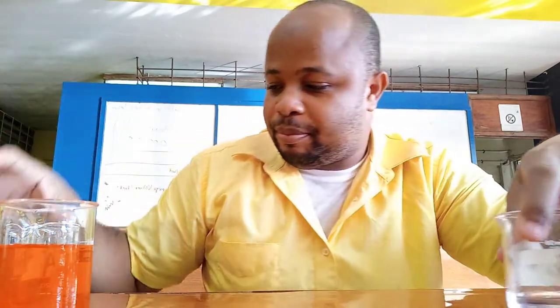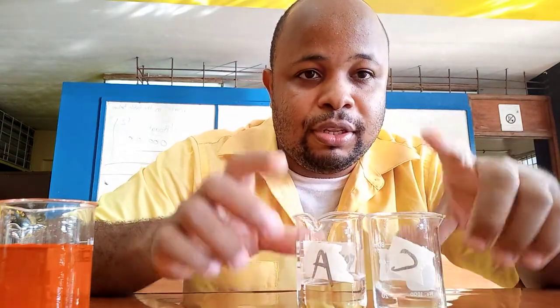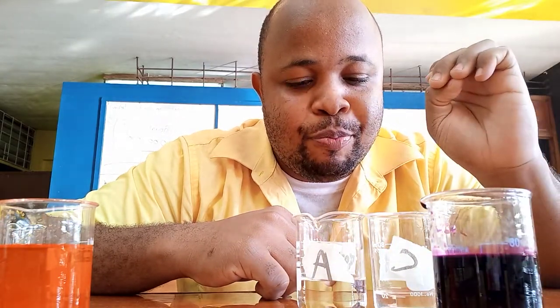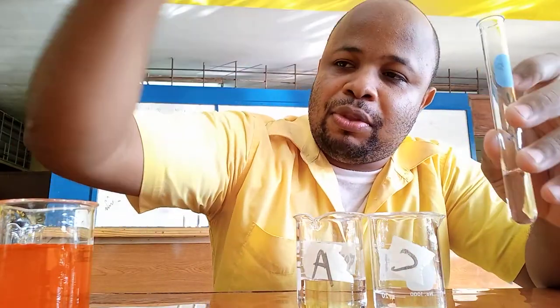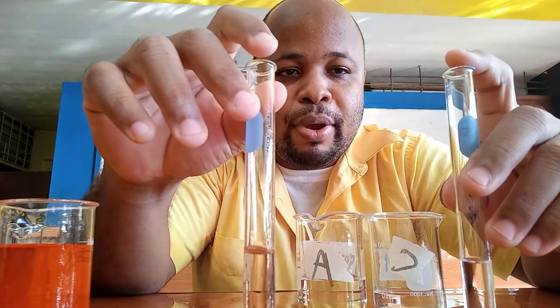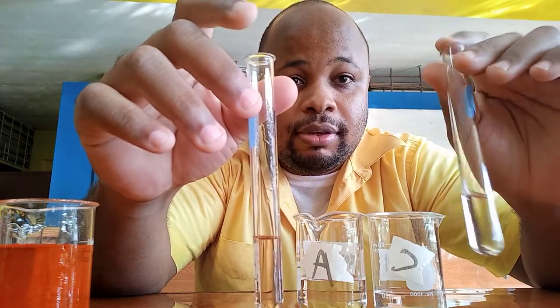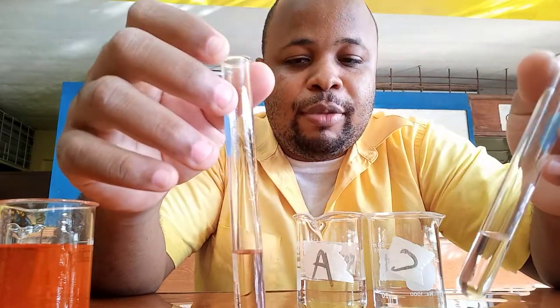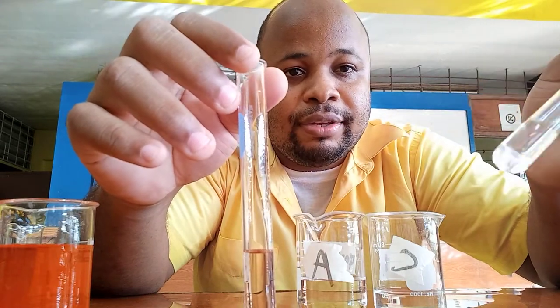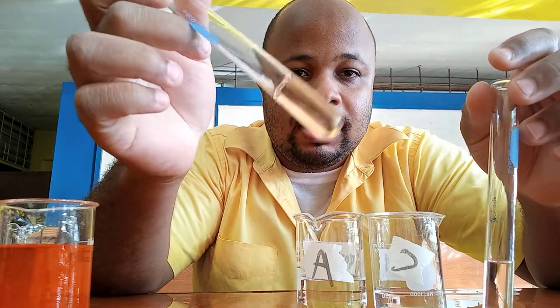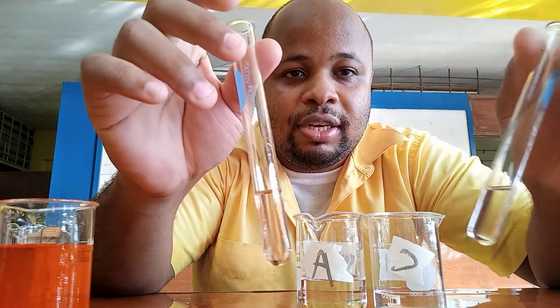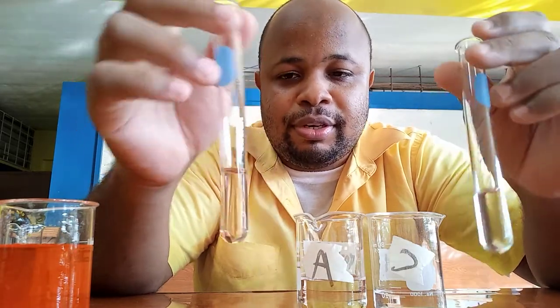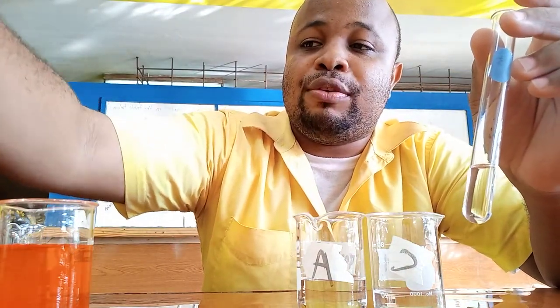So it's either primary or secondary. We have container A and this one, and both have decolorized the potassium permanganate. We know that primary alcohols are oxidized to aldehydes, which may be further oxidized to carboxylic acids, and secondary alcohols are oxidized to ketones. You could do further tests to determine if the products are aldehydes or ketones. That's it with the potassium permanganate.